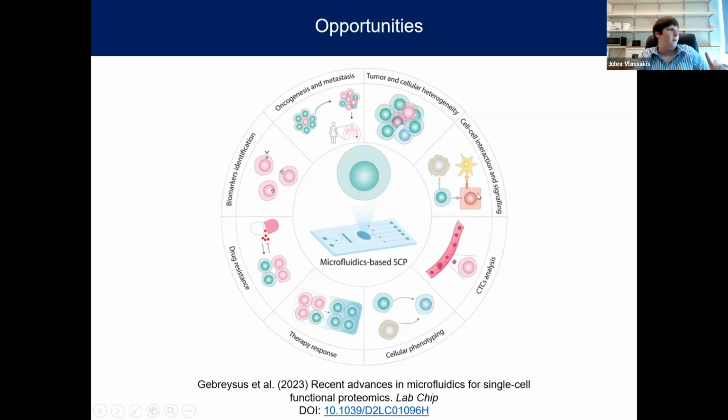So one thing I didn't mention that I meant to along the way is some of the suites of methods that are well suited for cytokine detection. So definitely shout out to Rong Fan's lab now at Yale, and his company Isoplexis for making cytokine measurements feasible for the masses.